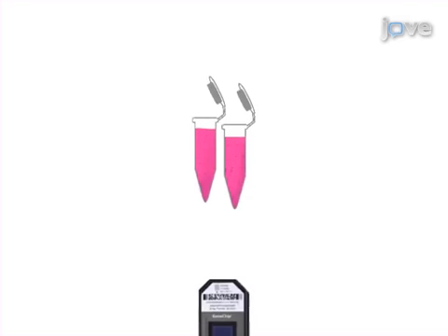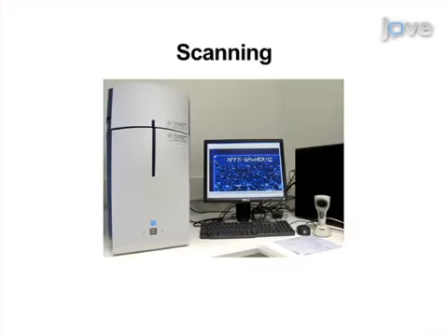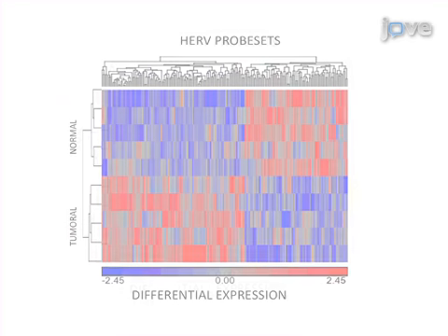Then, sequentially process the HERV V2 microarray by filling, hybridizing, washing, and scanning. Ultimately, using biocomputing methods, probe sets exhibiting significant signal and differential expression can be tracked, leading to the identification of transcriptionally active individual loci.